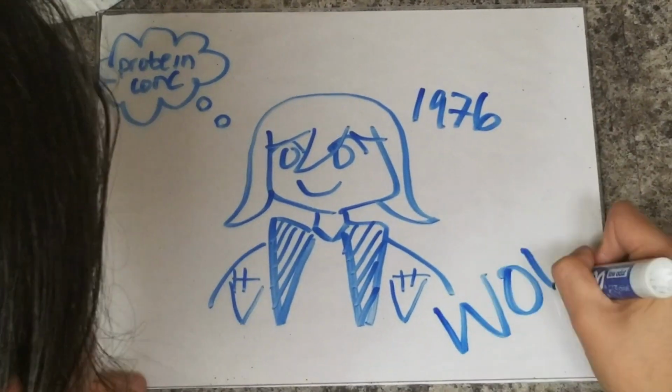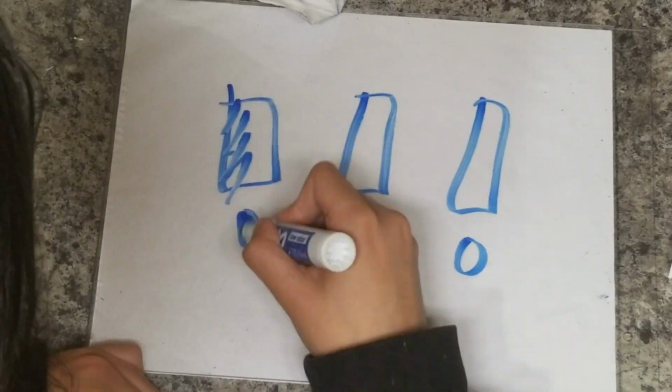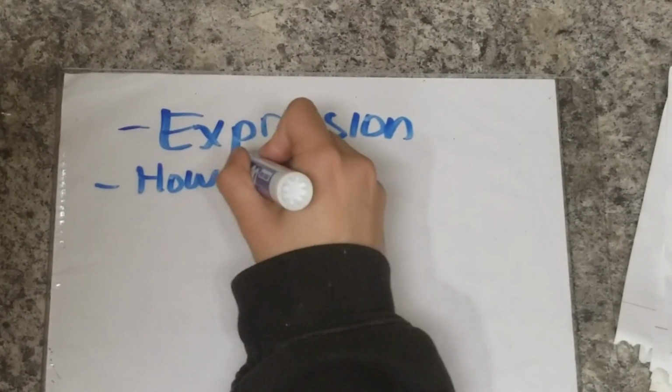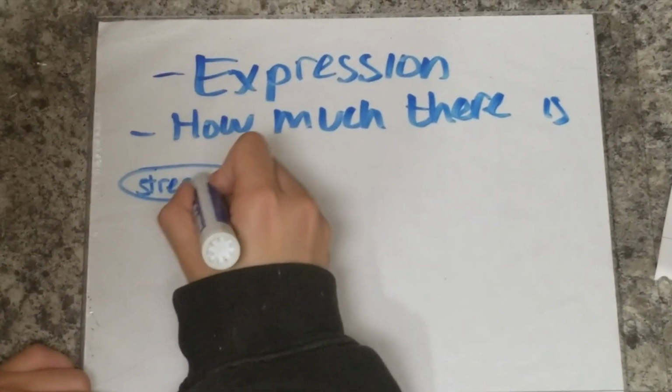But why would you want to find the concentration of protein in a sample? That's a great question. You would want to find the concentration of a protein in a sample in order to study its expression and find out how much there is.